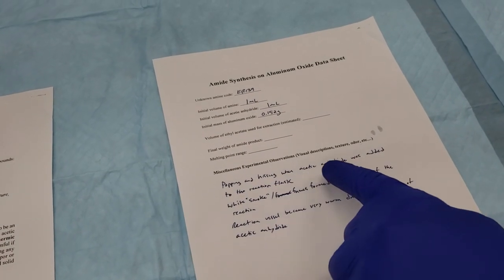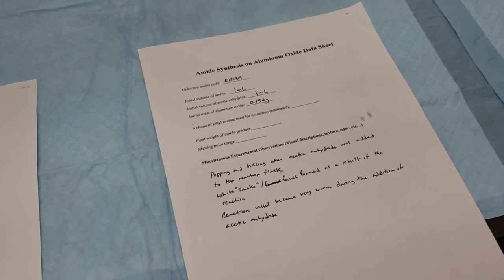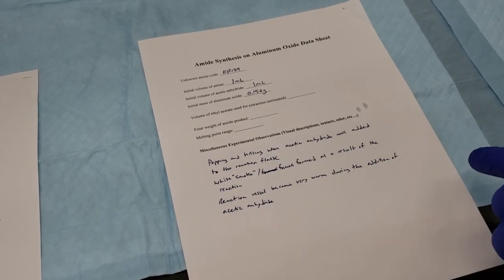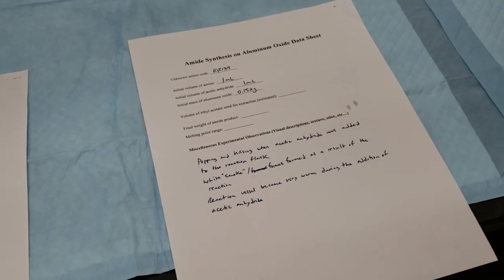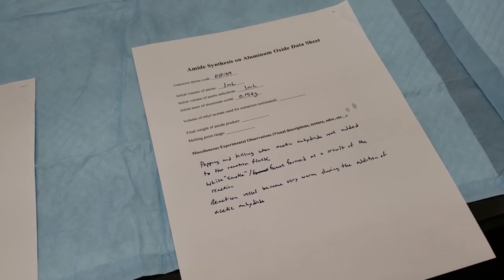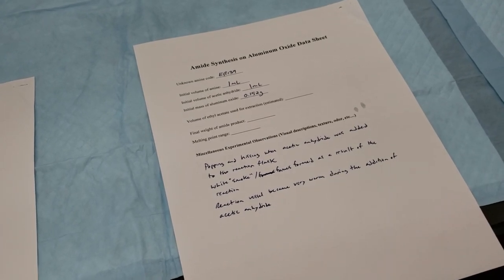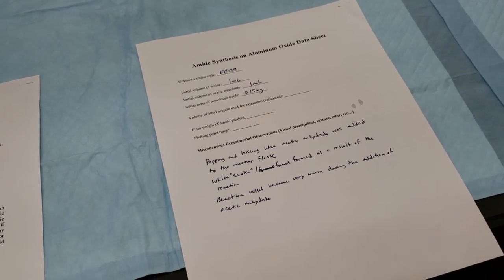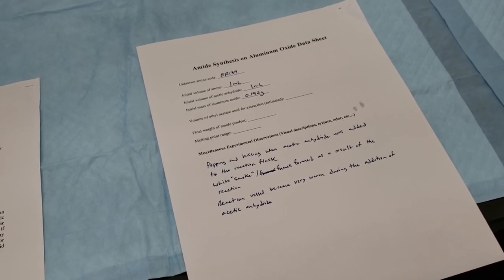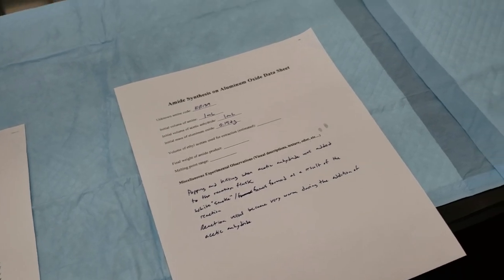Popping and hissing when our acetic anhydride was added to the reaction mixture, so that was something that we observed. We also saw the evolution of white smoke or fumes that were formed as a result of our acetic anhydride being added dropwise. And then our reaction vessel became very warm during the addition of our acetic anhydride. So all observations made during the initial course of our reaction here. Once we're finished swirling, we'll come back and start our extraction process.